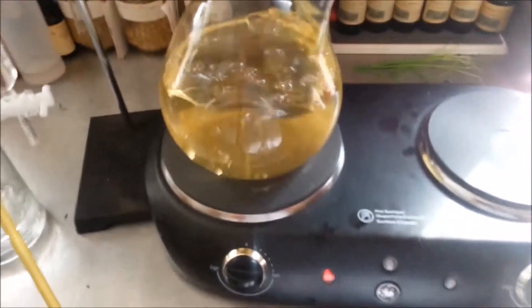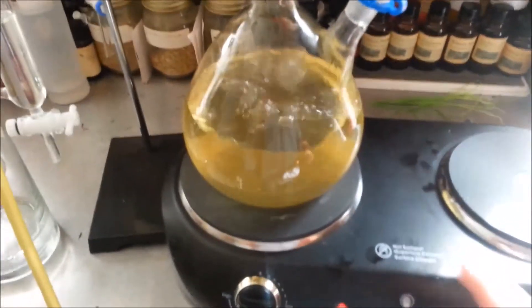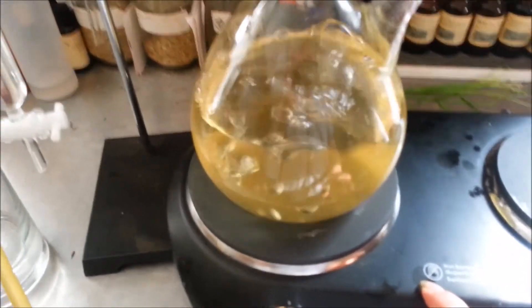Hey everyone, it's Reverend Adam again. I wanted to share with you my essential oil distiller today. This is the lab glass version that I'm using, and it's the vertical version. I have it on a hot plate already.